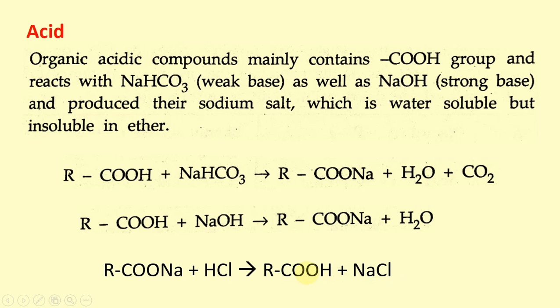So we get the acid back in pure form, by reprecipitation with HCl. These are the things for acids.